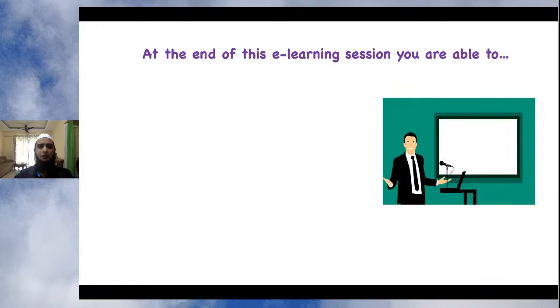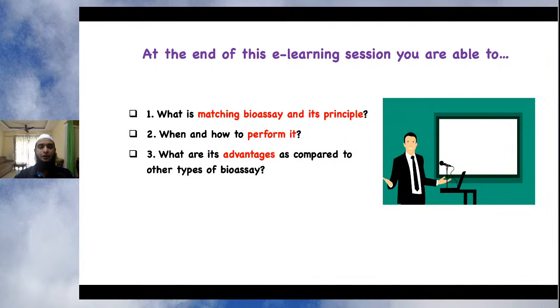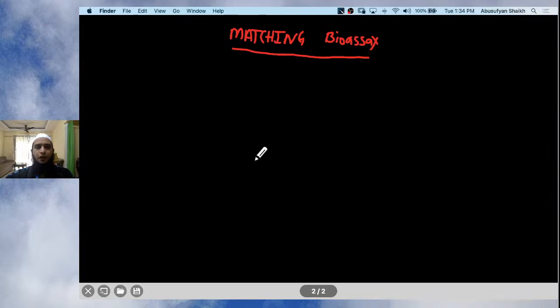At the end of this e-learning session, you will be able to answer what is matching bioassay and its principle, when and how to perform it, and what are its advantages as compared to other types of bioassay. So we'll study how to perform the bioassay. First we'll see what is the meaning of matching bioassay.